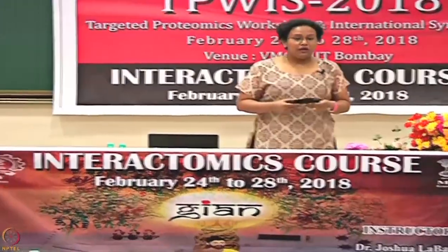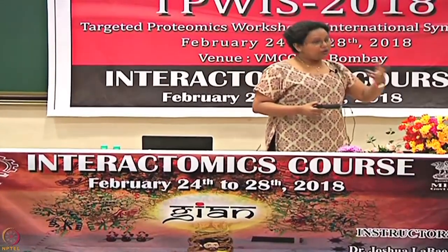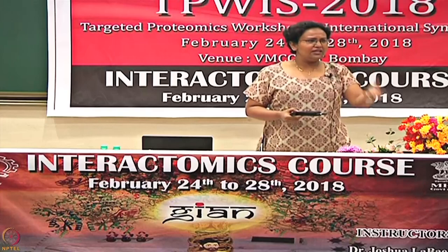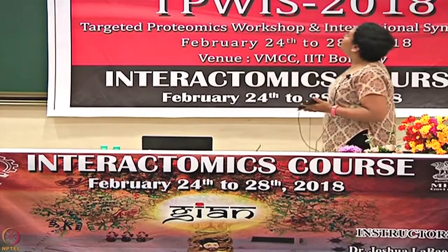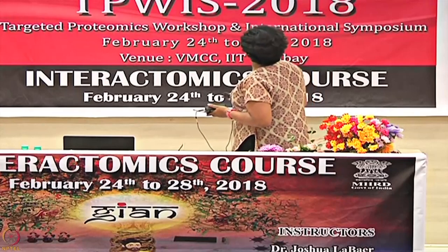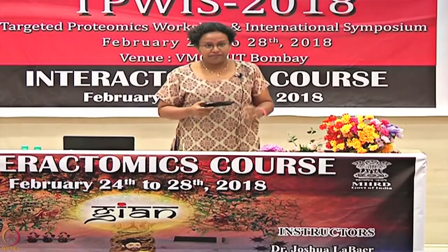So when we are doing a ligand immobilization and sometimes we see that we are not attaining the amount of RU that we are expecting, this is something that is extremely important, apart from the chip quality and EDC quality and things like that. So this is also something very important to keep in mind. This is the same thing that we talked about. Now, not all the time you may have information about the correct pI, right?